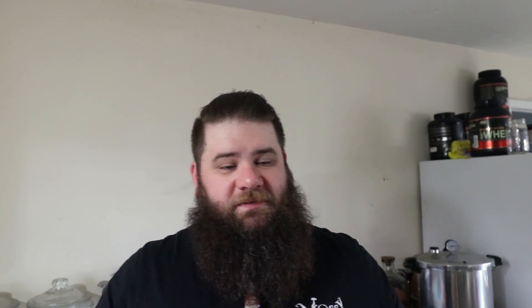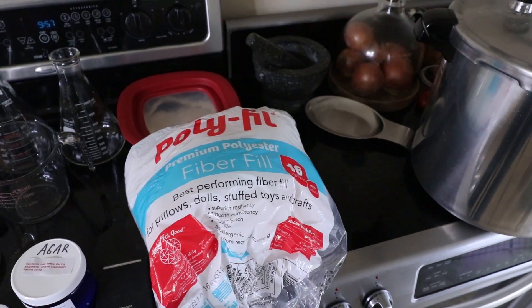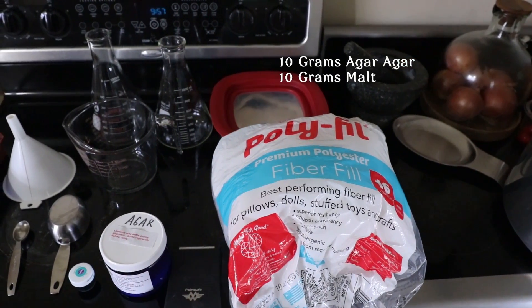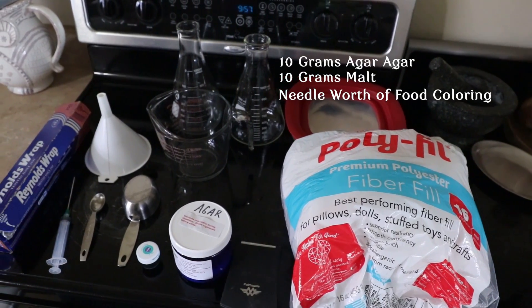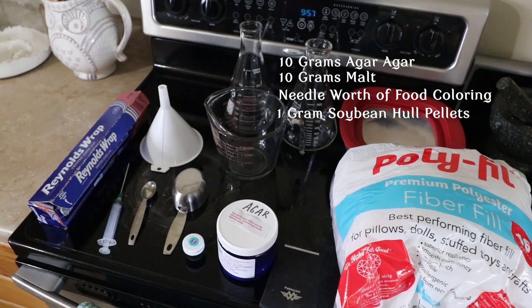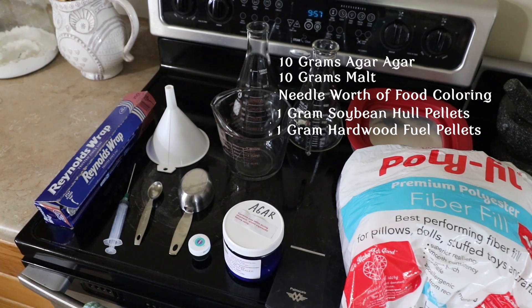So whenever you're making your agar mix, whether that be for your culture slants or your petri dishes, I always try to make it at 500 milliliters at a time using 1,000 milliliter Erlenmeyer flasks. What I tend to do is 10 grams agar agar, 10 grams malt extract, and food coloring if you want to color your agar — you can make it plain if you want — and then a gram each of soybean hull pellets and hardwood fuel pellets. That makes my basic agar mix.